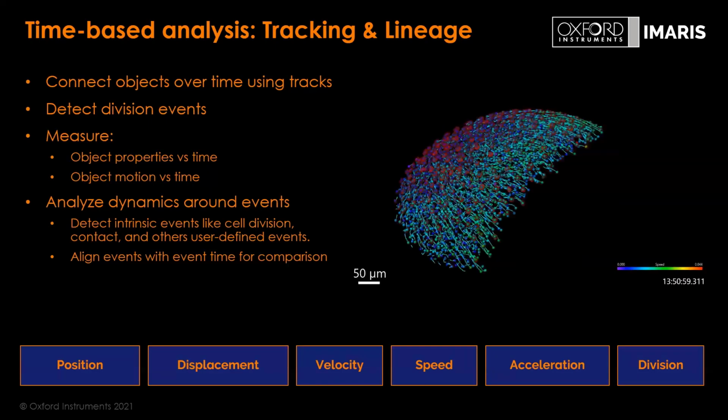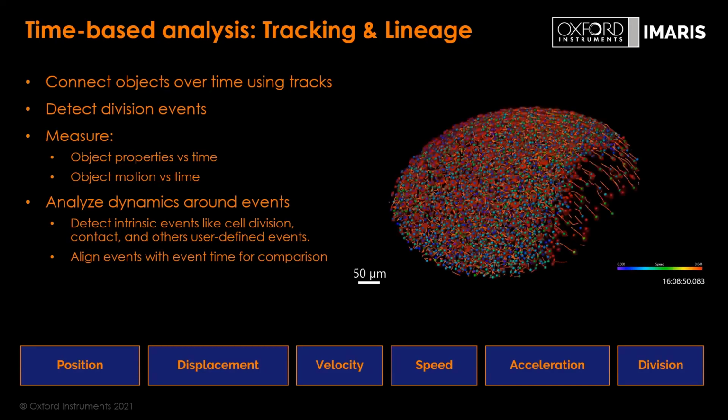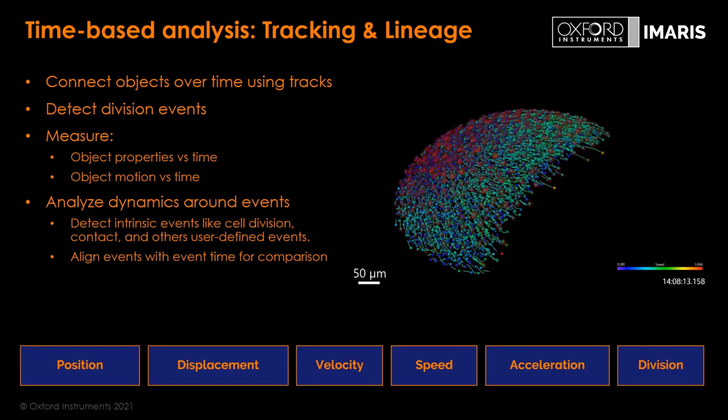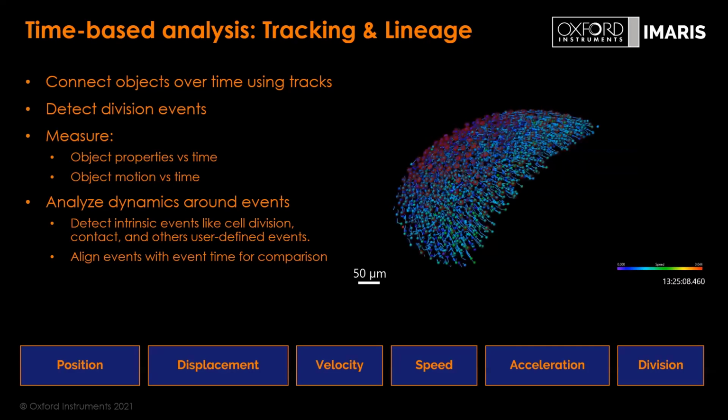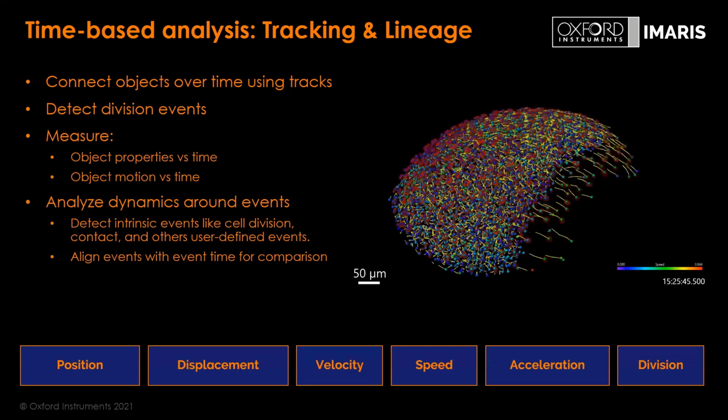And you can use the cell object to detect whether the number of vesicles or the number of foci is changing inside a cell over time. And then finally you can use the filament object to determine whether the thickness or the length of the dendrites is changing over time, those kinds of things.